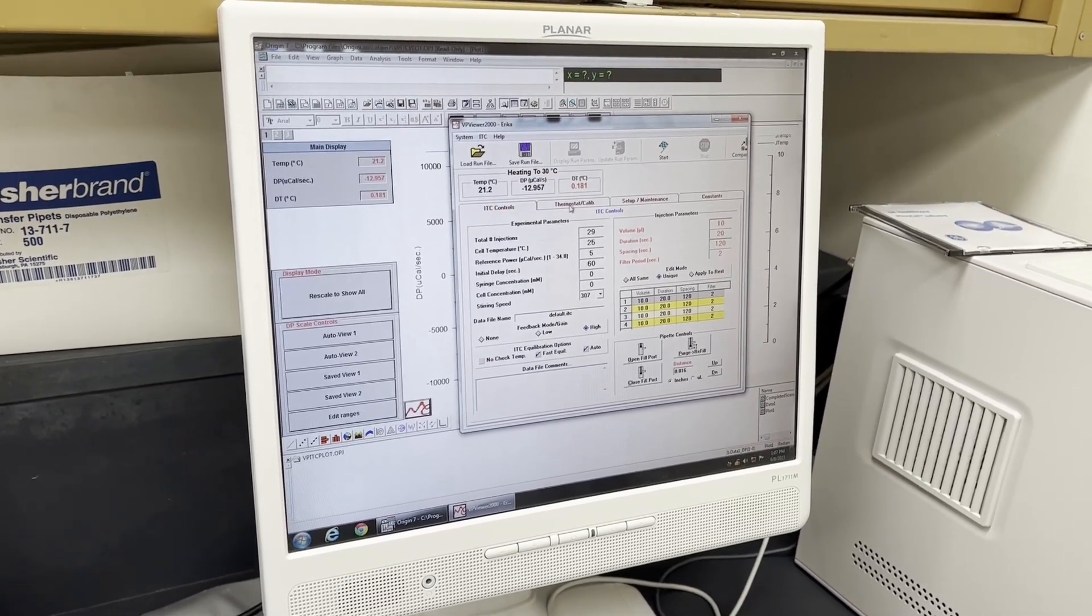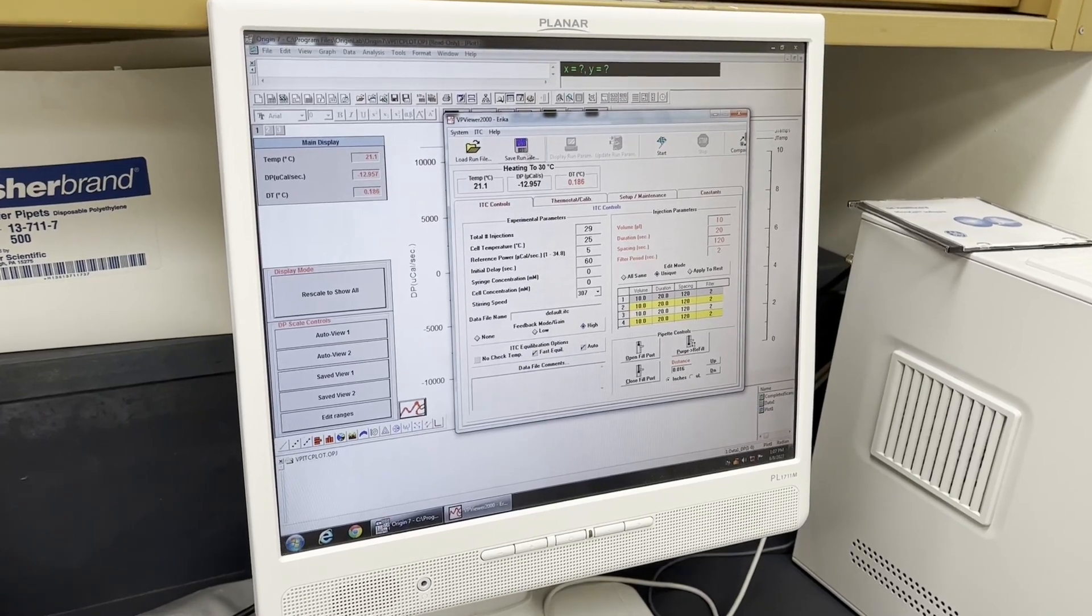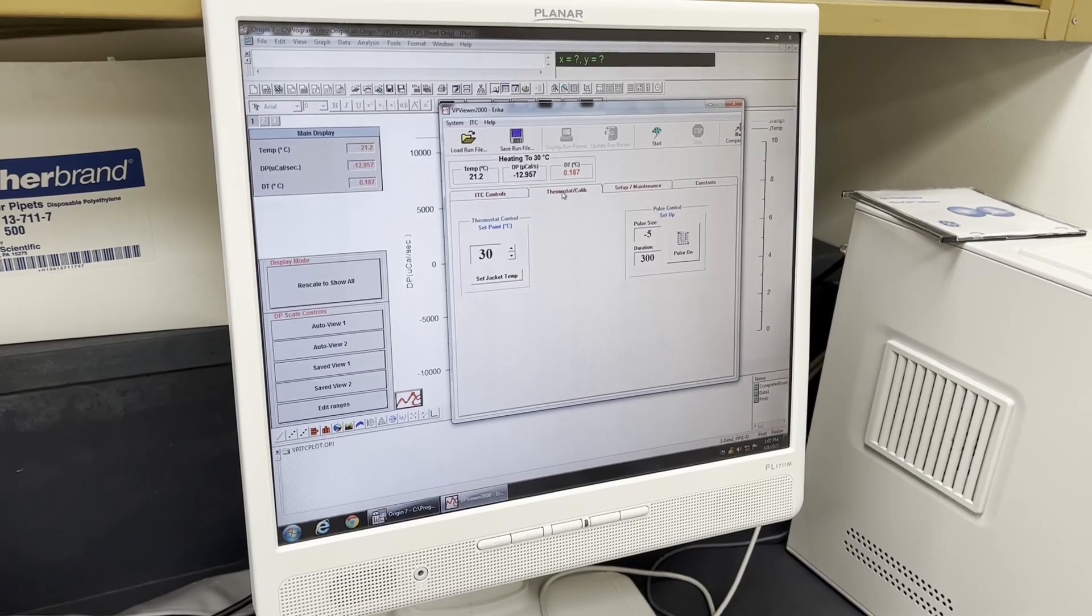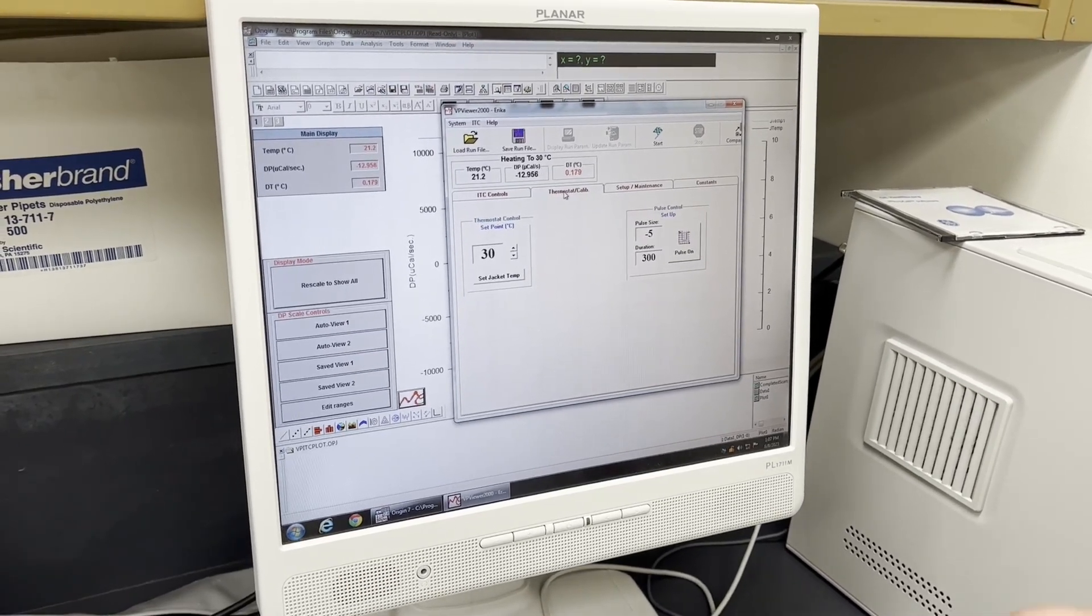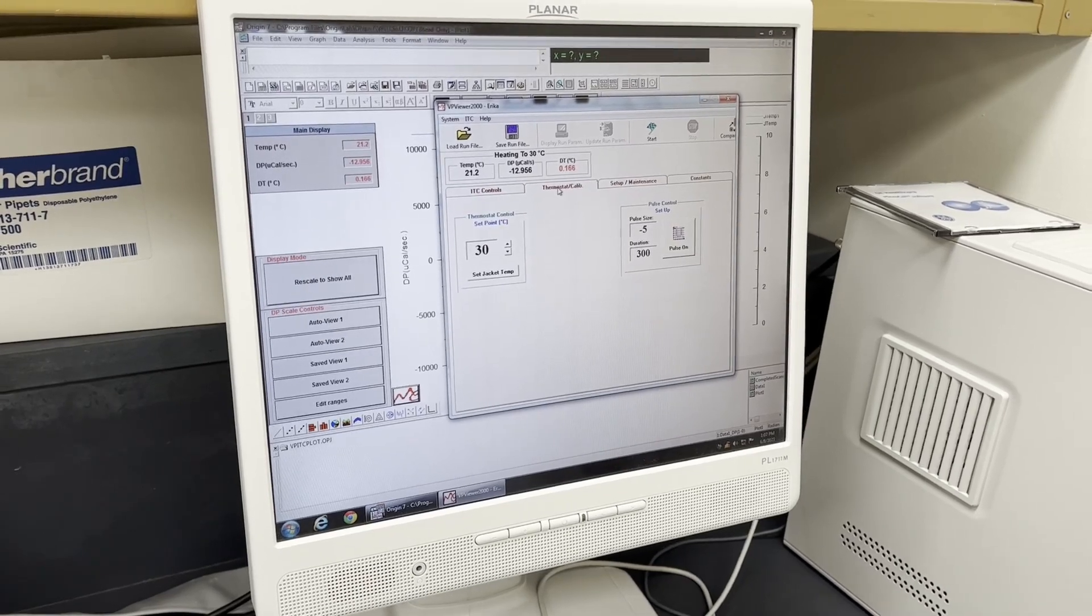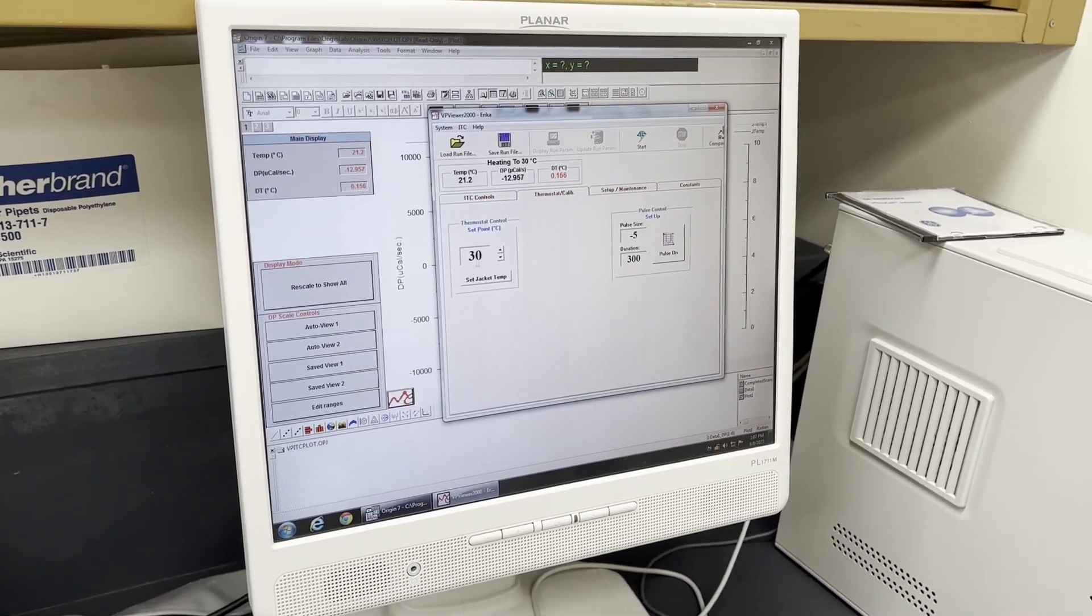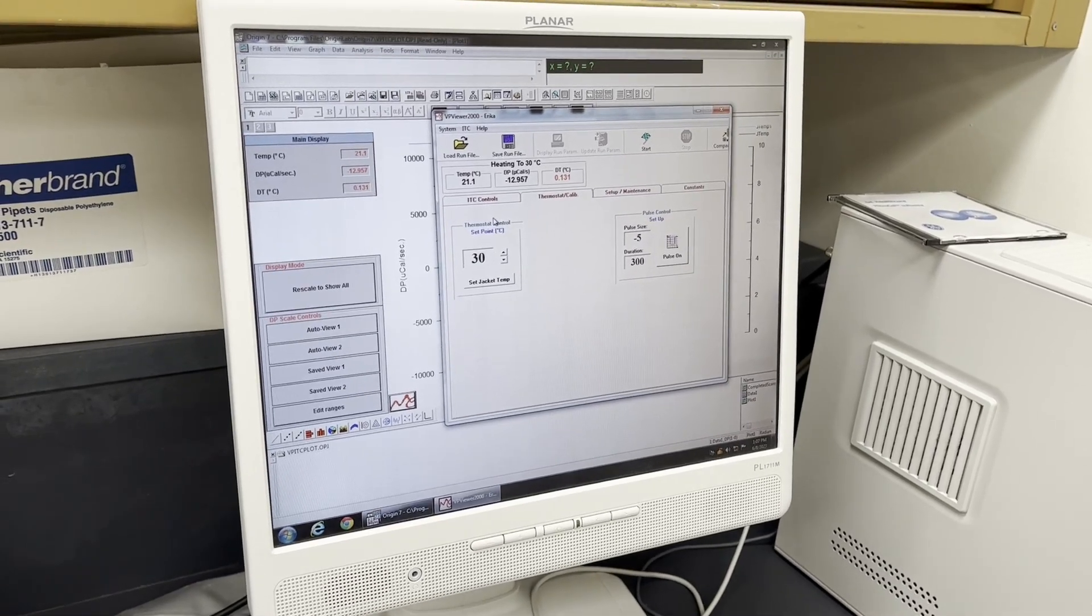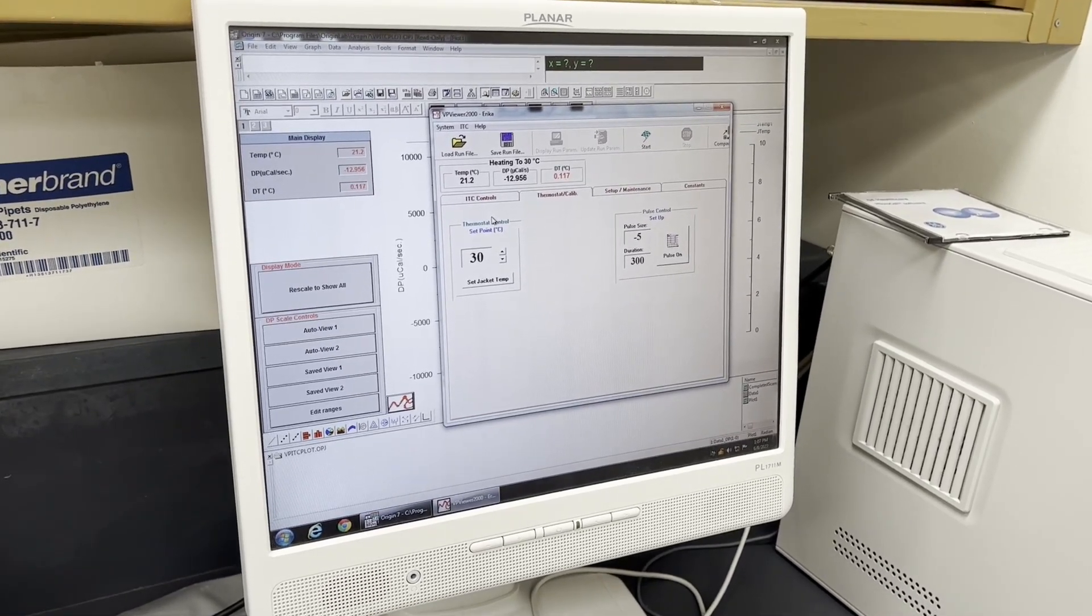What you want to make sure, we can keep it to 30 degrees, but it takes a lot longer for the ITC to cool down than heat up. So if you're planning on running your sample at 25 degrees or room temperature, you may want to change this to 24 or 25 degrees just so it can establish that baseline before you start your run.